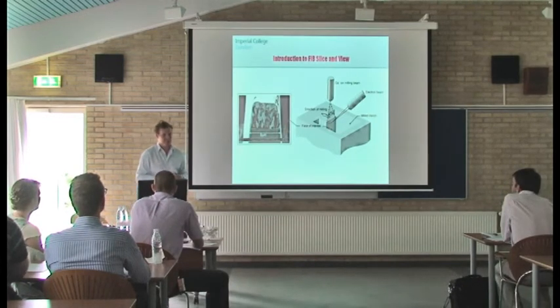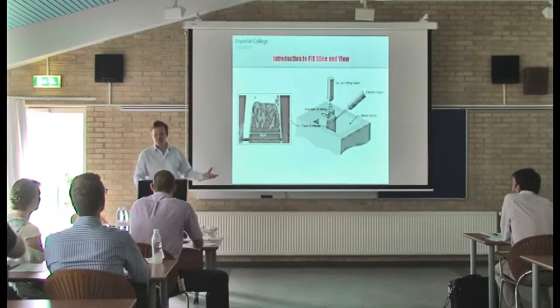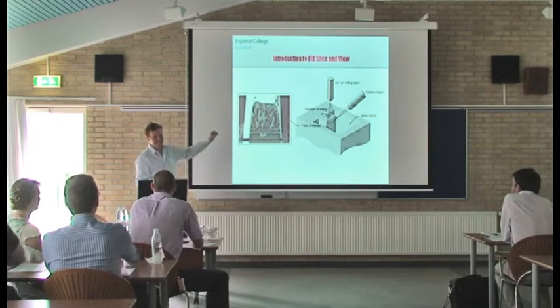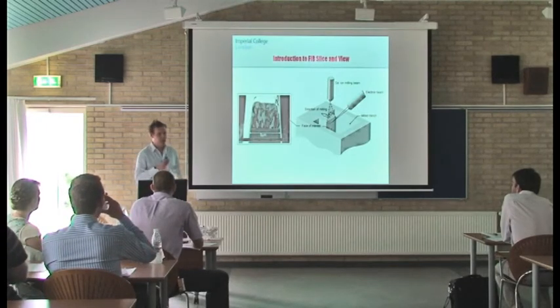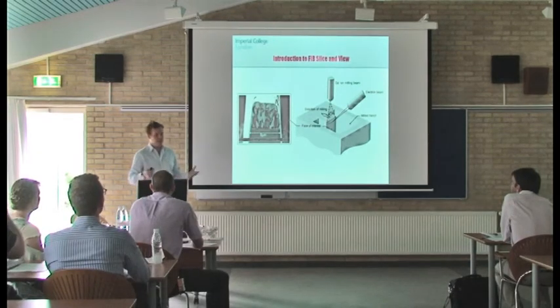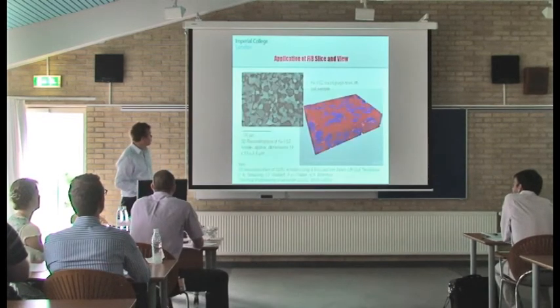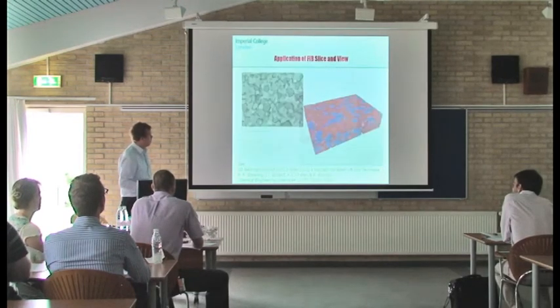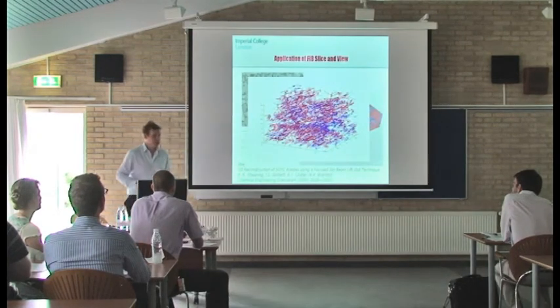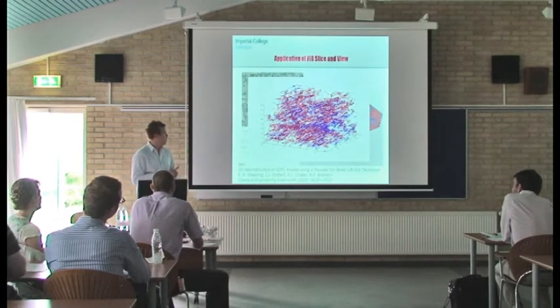So when James was talking before about writing code to get rid of little grey edges, I guess we've all sat down for a couple of weeks and written code to get rid of little grey edges, and a lot of these problems are shared. So I think that's a great focus for this meeting, to try and get some kind of idea of the way that all of our techniques correspond. Yeah, so obviously we have techniques for reconstructing and then extracting triple phase boundaries. Again, this has all been published, and I guess we all have our own slightly distinct ways of doing this.